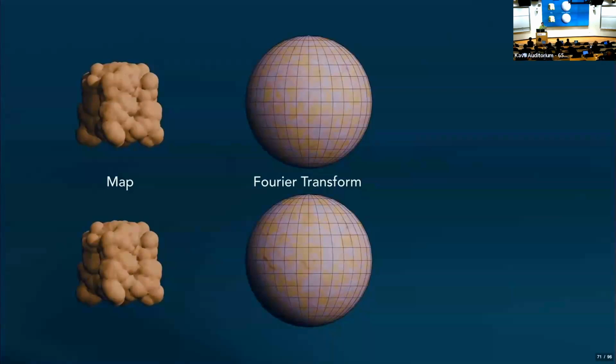So when we're making these maps, we don't just say, all right, all these particles in all their poses, average them together to make one beautiful map. We actually split them into 2 halves, half A, half B, right? The Capulets and the Montagues, whatever you like. And never the twain shall meet. They are aligned completely independently, and they make maps completely independently. Okay, so we have half map A and half map B.